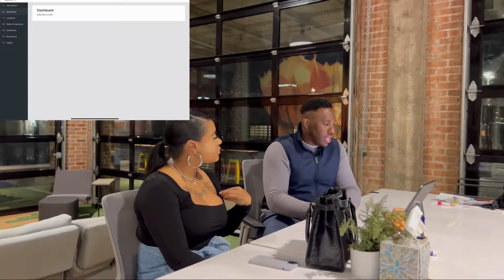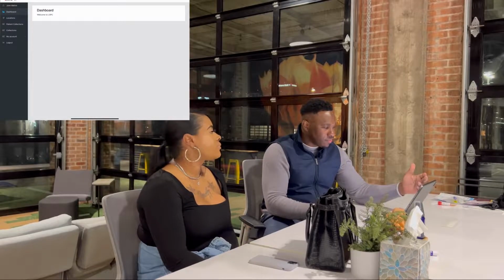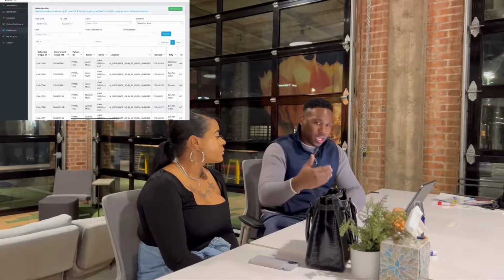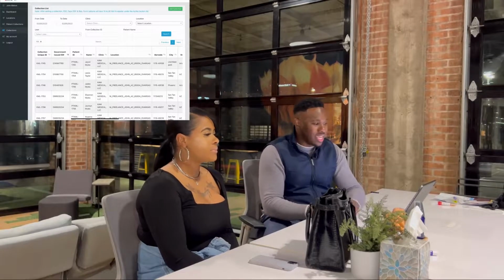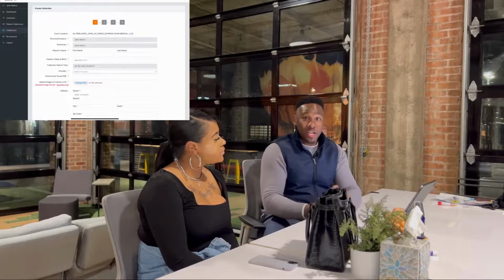Now, after I hit freelance Arizona and hit submit, you're going to see different options. The option that you want to choose is collections. So we're going to go ahead and hit collections. Now, once you hit collections, in order to input someone and get them started with a COVID test, we're going to go into the top right hand corner and hit add collection. So let's hit add collection. All right, now we're ready to actually get started.